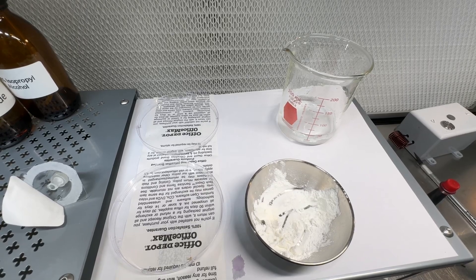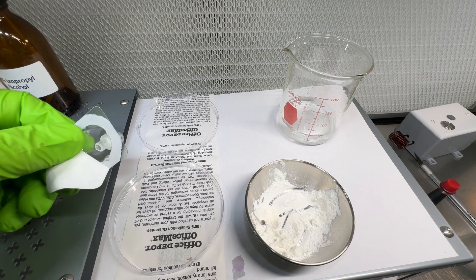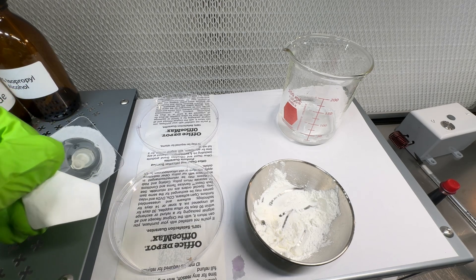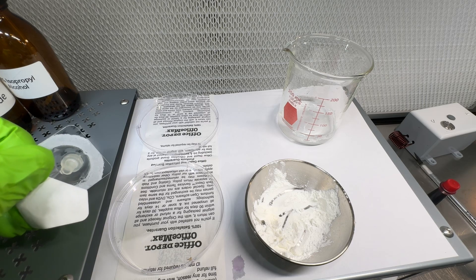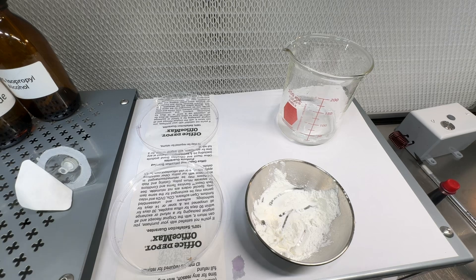A lot of people had questions about filtering with a syringe filter. We are using a PES style filter, 0.22 microns, which should get most of the bacteria that would potentially be found in a lyophilized vial. This is a four millimeter filter housing, which is a pretty small one.